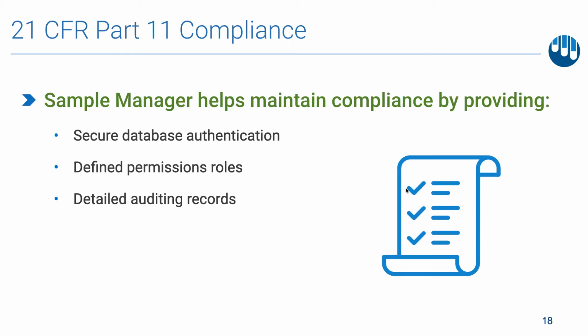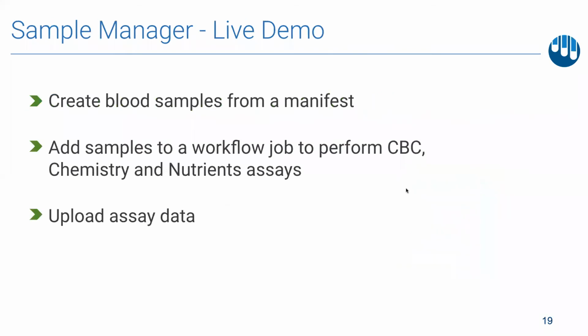So now that you've heard about how Sample Manager can help in your lab, it's time that I show you in our live demo. So for this today, I'm going to pretend that I'm back in the lab, responsible for receiving our blood samples and generating the necessary data associated with those samples. So in this pretend lab, after the blood is received, we'll want to analyze the samples for complete blood count, chemistry, and nutrients, and upload that associated data. So I'm going to hop in to our live demo here.